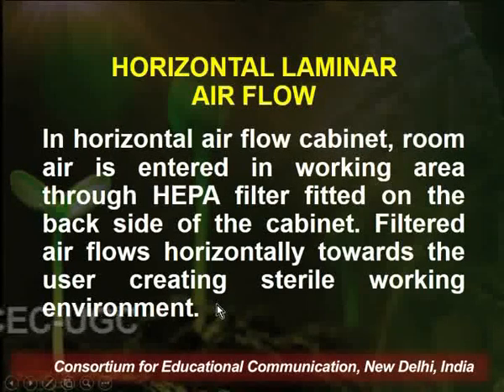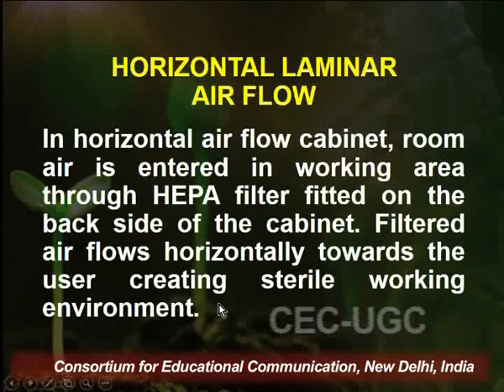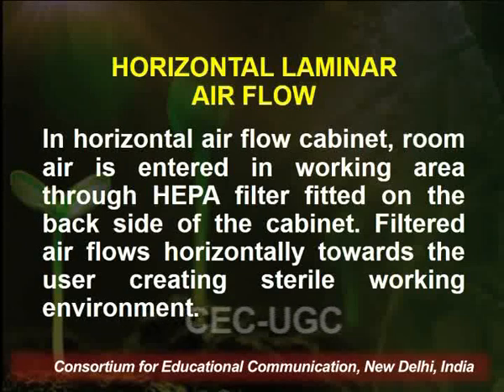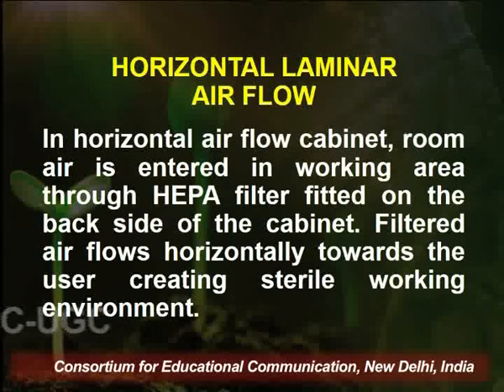So what is a horizontal laminar airflow? In a horizontal airflow cabinet, room air enters the working area through a HEPA filter fitted on the back side of the cabinet. The filtered air flows horizontally towards the user, creating a sterile working environment.